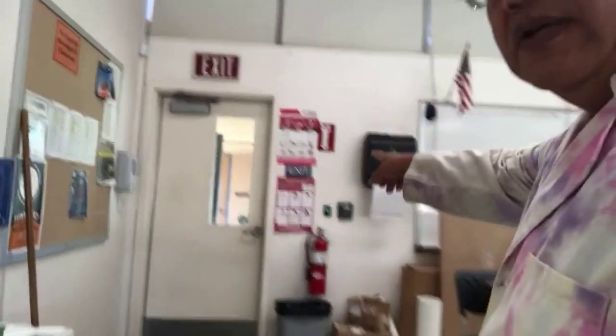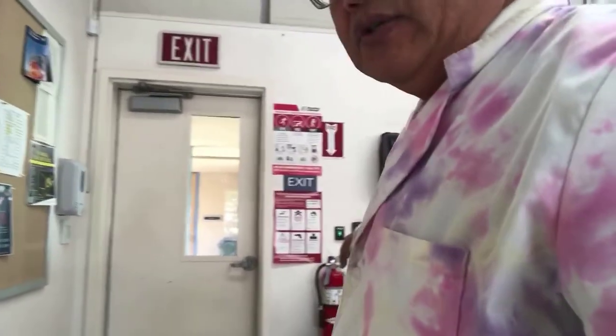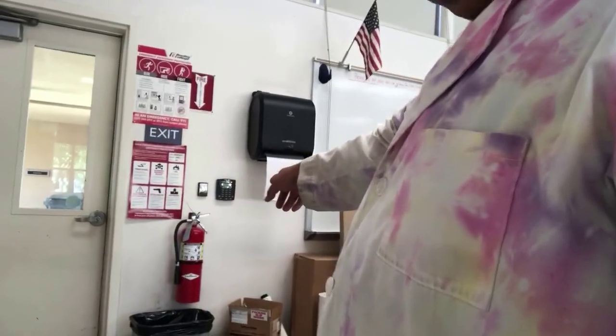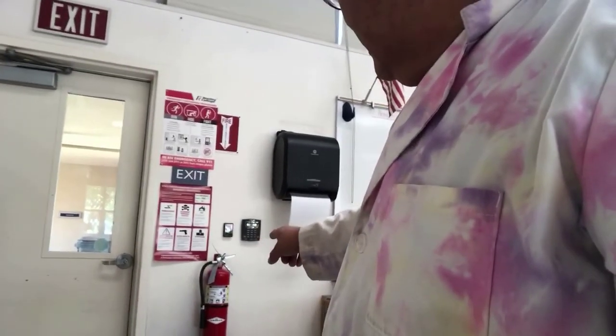The other thing that I want to do is take you on a tour around the room. Right now we're in Physical Science, PHY 82, and this is the main entrance to the lab. You'll notice we have a fire extinguisher. I really don't want you to try to use it unless you've been trained. That's the caveat. It's for putting out fires, but unless you've been trained to use it properly, a lot of people end up making the fire worse by using it.